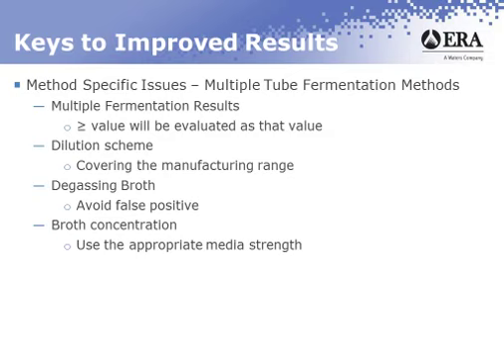So broth concentration, you want to make sure that you're making it at the appropriate strength for the method that you're using. If it's double strength that's required, you want to make sure that you're doing it. If you're not doing it at the right strength, it's very possible that the aliquot of sample that's being used, you can end up with a negative result just because essentially you're not following the method.